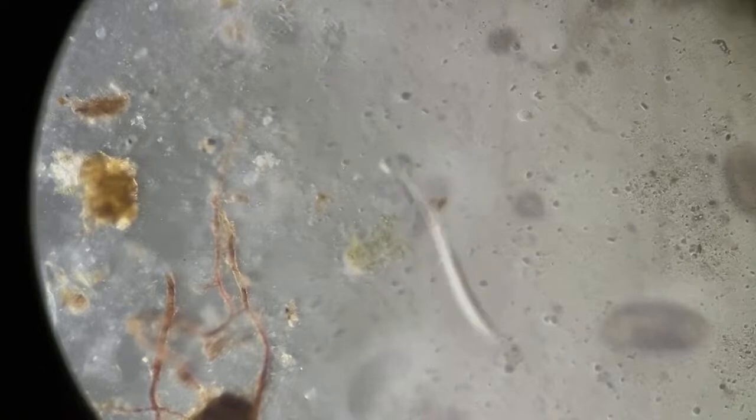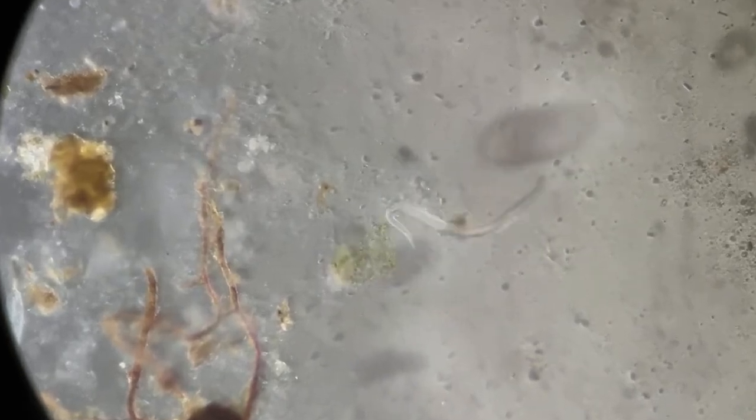Okay, so we'll try to go back to the tick that we had here. There was, remember, a small tick which was decaying and was attracting a lot of creatures to nourish themselves with. Another worm wriggling around. See, the details in this picture are relatively much more rewarding than the normal X-ray sort of view from the normal microscopic light.